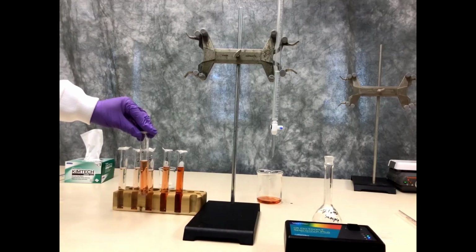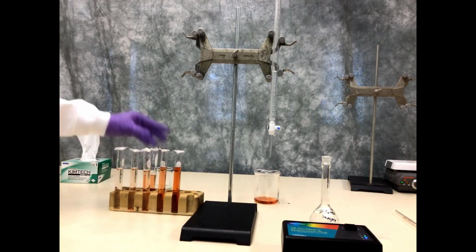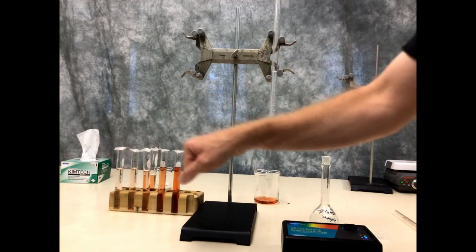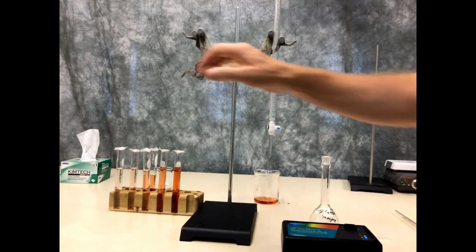Now we're going to take a sample of each of our standards to make our Beer's Law curve, and then finally we'll do a sample of our cuvette with some of our sample in it to figure out where it lies on that Beer's Law calibration curve.